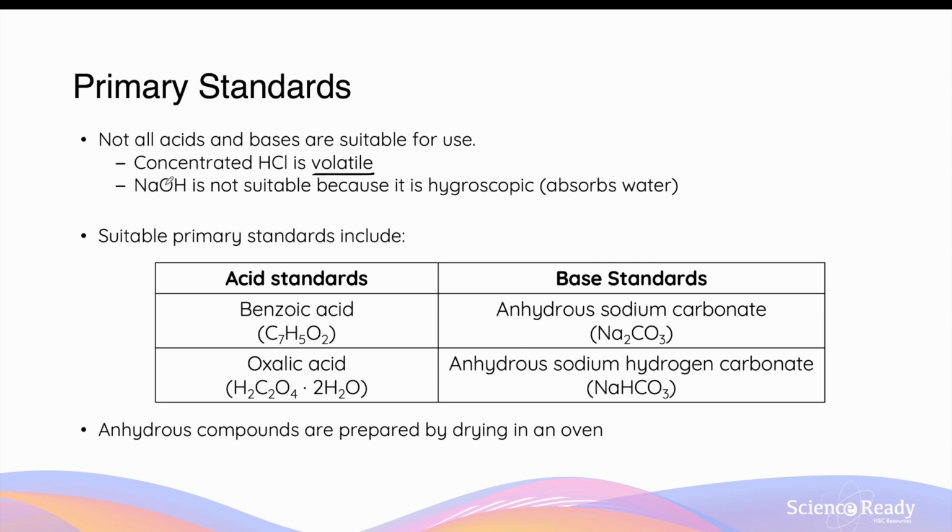Sodium hydroxide, which is a very common strong base, is not suitable as a primary standard because it is hygroscopic, which means it readily absorbs water. The absorption of water from surrounding air will reduce the purity of sodium hydroxide.